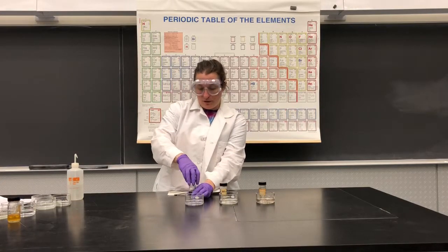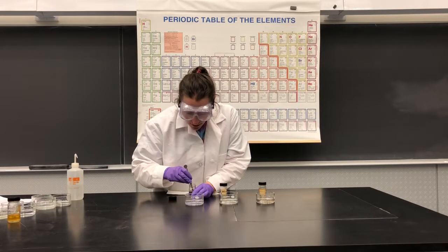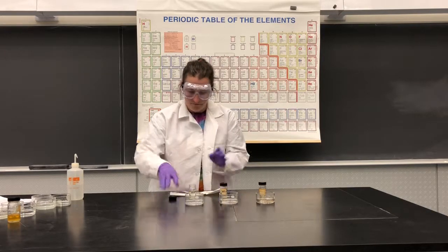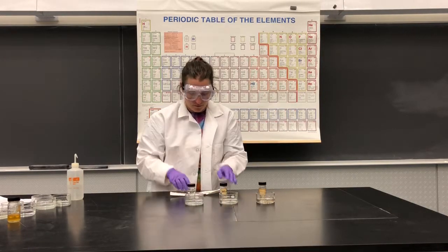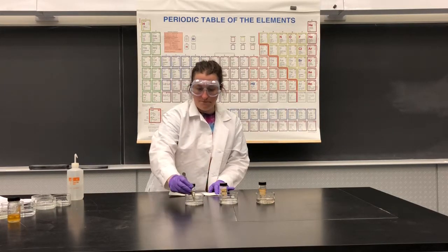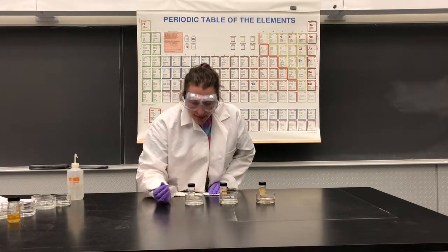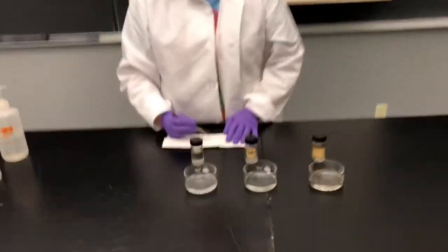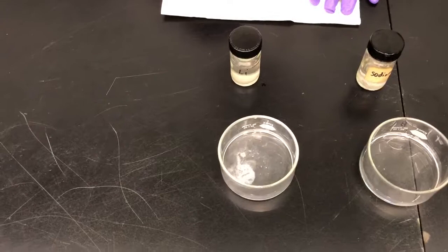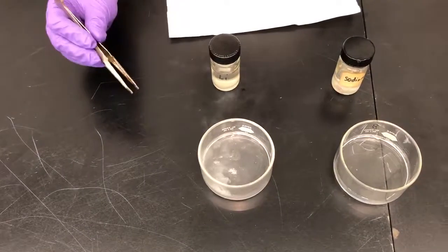I'm going to start with the lithium — fishing out a little piece of it and blotting the oil off of it, then dropping it in the water. Now if the camera were close enough you'd see some fizzing. We have a reaction going on right now — you can see the fizzing, a little bit of gas coming off.